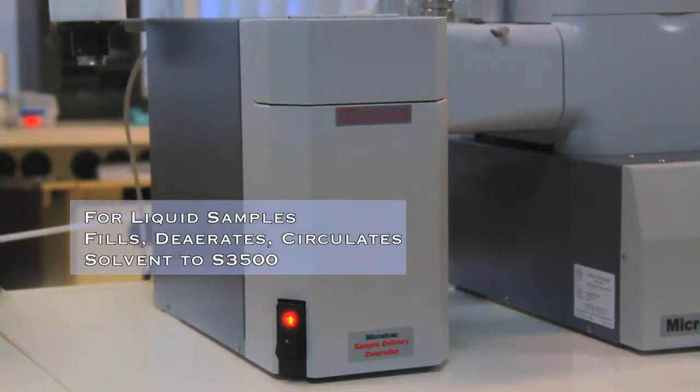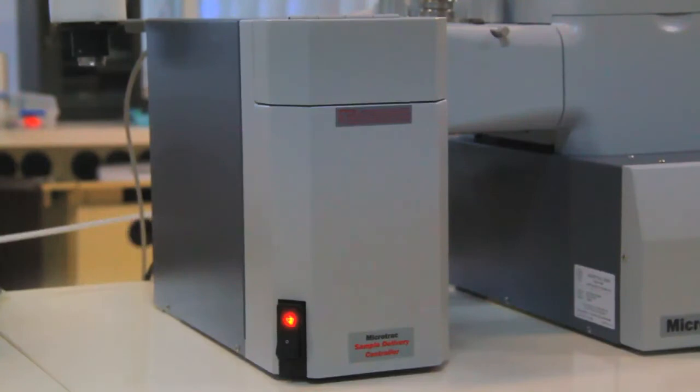The SDC automatically fills, de-aerates, and circulates the background solvent to the S3500.